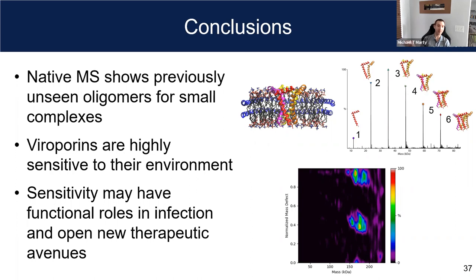But we do see with some very preliminary cross-linking that we get what looks like a hexamer band from that LDAO pH 5. I think that's pretty cool. We can basically deplete the refolded tetramer, and it will bump up to a hexamer. I'm hoping we can finish these experiments quickly and get it back out for review.